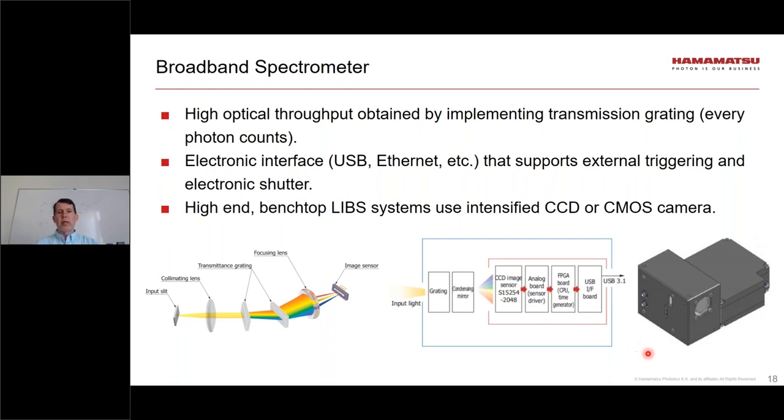And it's important as well that the spectrometer have very good optical resolution, and that would be its ability to distinguish between neighboring peaks. We saw in previous slides how rich the LIBS spectra is, and that there are many, many analytical lines closely coupled to each other, and one needs to have a spectrometer that has adequate optical resolution in order to be able to resolve those lines.